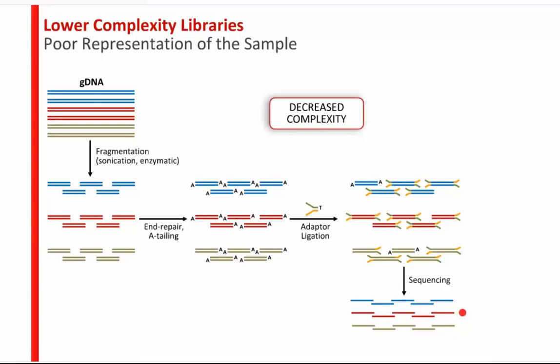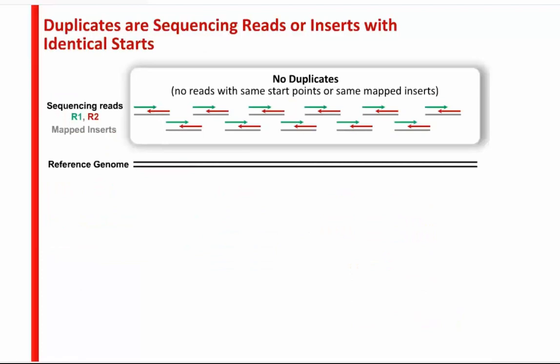Now let's talk about duplicates. When we push the limits of NGS using smaller and smaller amounts of input DNA, duplicates become a very important factor. Here's a reference genome with paired-end sequencing clusters — the gray lines are mapped inserts. In a non-duplicate scenario, all reads are unique with different starting points and unique mapped inserts. In a duplicate scenario, highlighted in orange, both the starting points of reads and their mapped inserts are identical — those are considered duplicates.